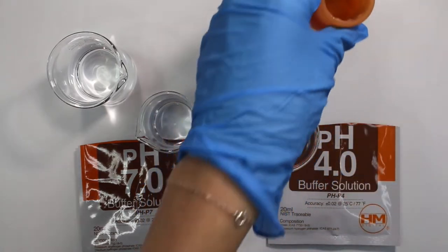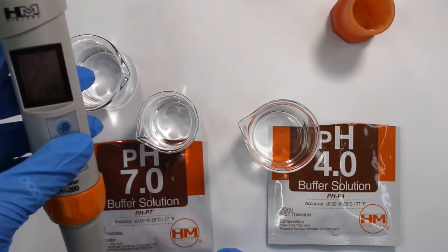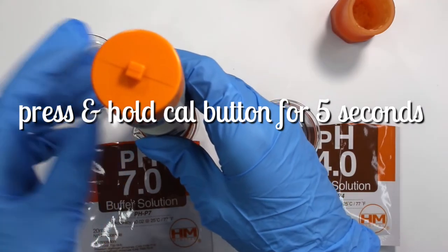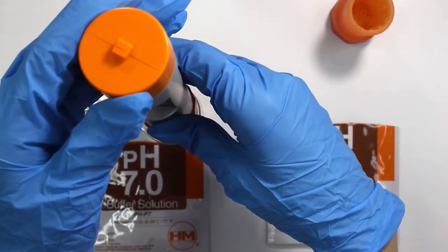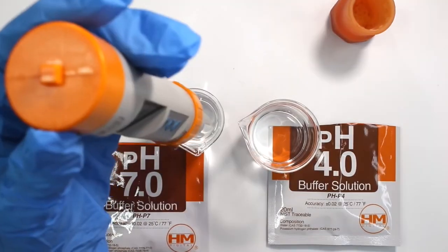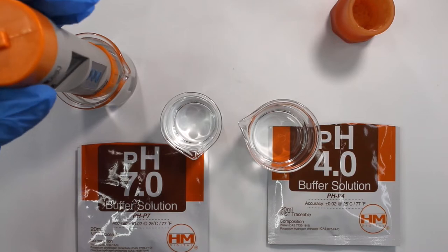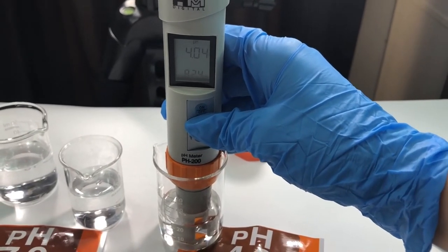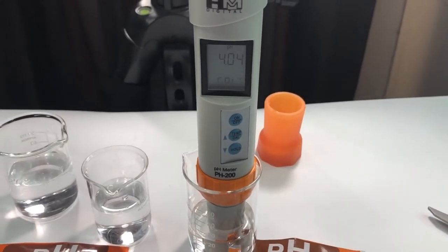First, rinse the pH meter in some distilled water, then turn the pH meter on by hitting the top button. The middle button is the cal button. When you dip your pH meter into the pH 7 buffer solution, press and hold the cal button for five seconds and then release. You'll see CAL flash for about a minute. It did take quite some time for the first calibration in the pH 7 solution, but after that it will flash END when it's done. Then dip it into the pH 4 solution and do the same thing — press and hold the cal button for five seconds, release, and it will flash CAL until the word END pops up, indicating calibration is complete.